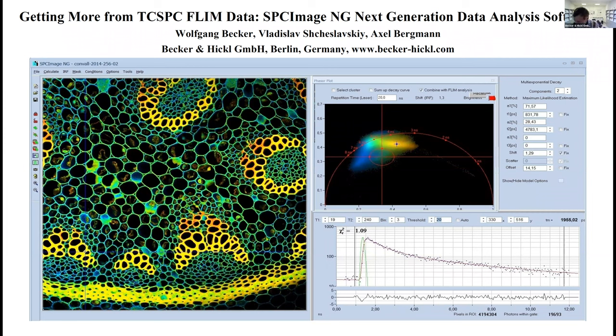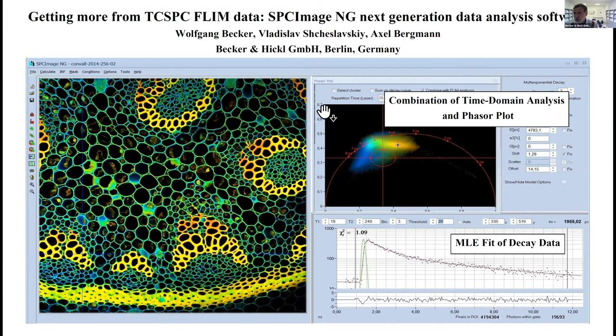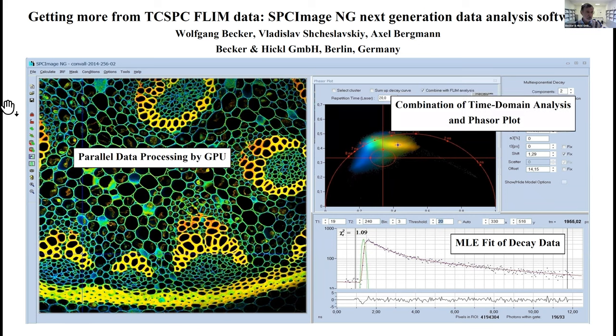Now the situation is a bit different because we have a new generation. It's the new generation of our software as a combination of time domain analysis and phasor plot. It uses maximum likelihood estimation of the decay data and runs parallel data processing on a GPU. So this all in all may not be a big leap for mankind, but it can be a big step for a FLIM user.